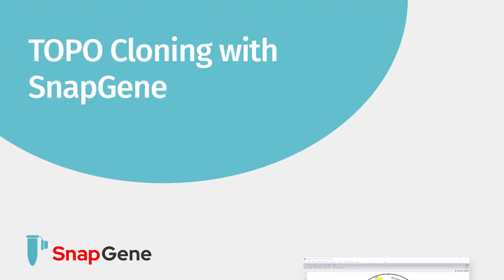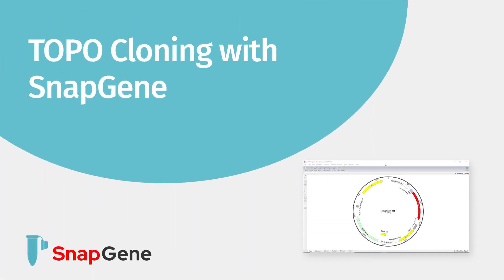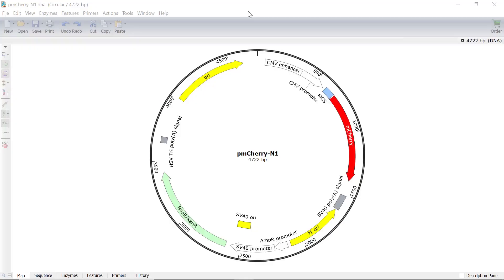This tutorial will demonstrate how to simulate topo cloning in Snapgene. You can simulate three variations of topo cloning in Snapgene: TA, blunt, and directional.